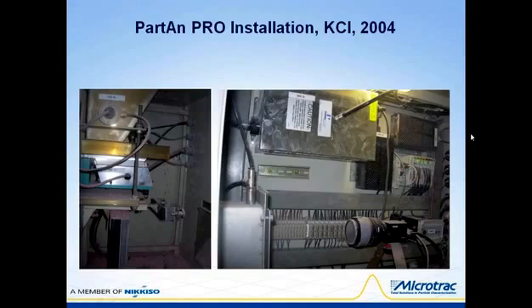Both a narrow size range and high sphericity of the KCl granules have to be controlled. This is a crushed material, so changes to the gap in the crusher can improve sphericity, and changes in feed rate can maintain a narrow size range.